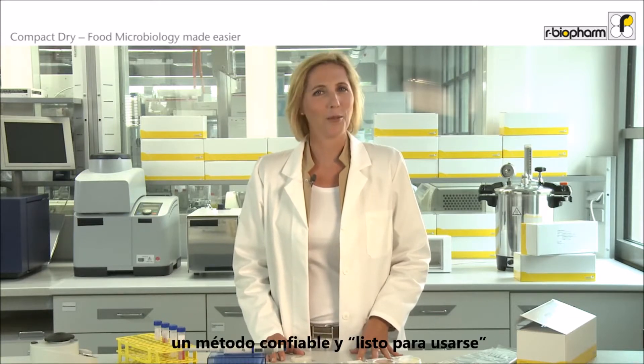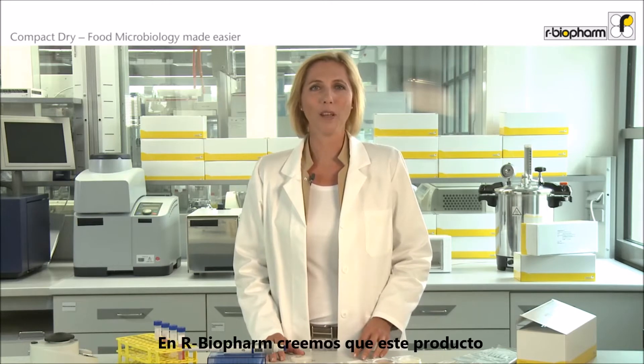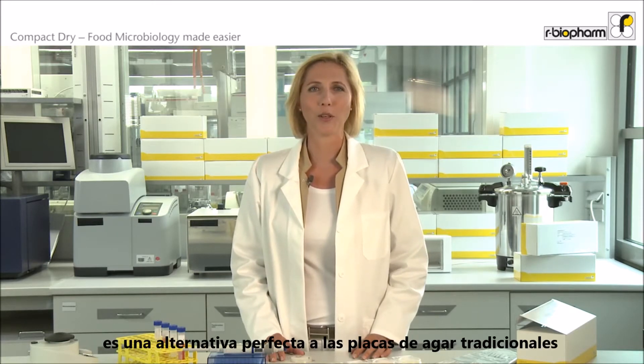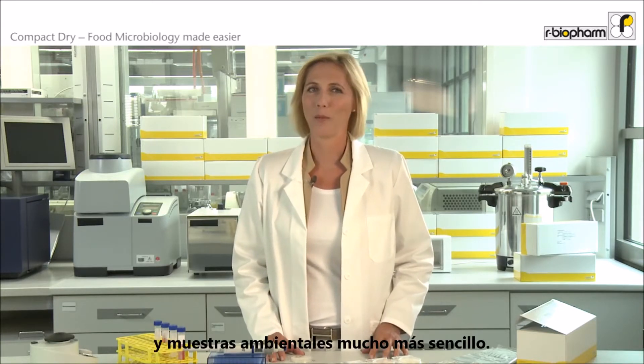Hello, today I would like to introduce you to an easy to use and reliable method for microbial testing. At our biofarm we think this product is a perfect alternative for using agar plates or other related products, and will make testing of food and environmental samples so much easier.